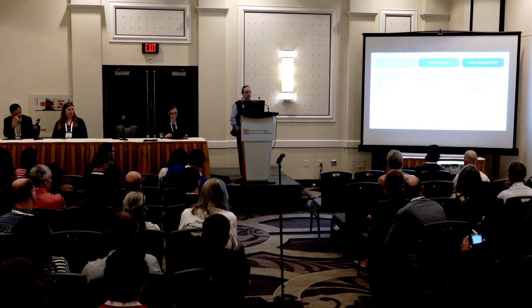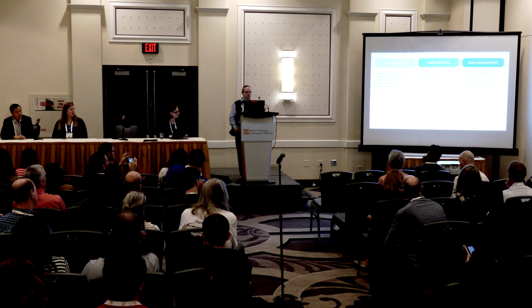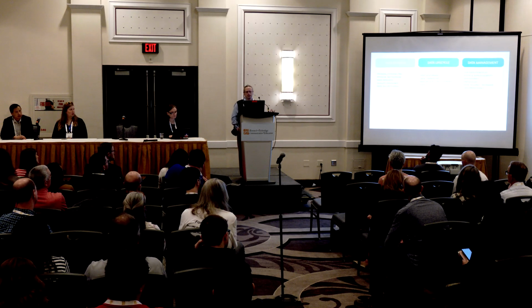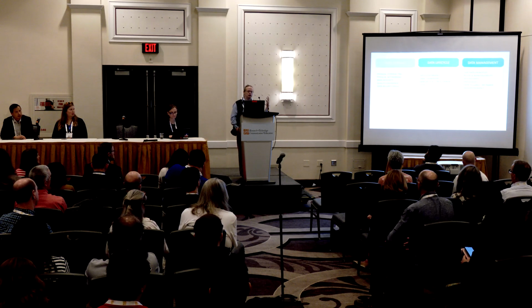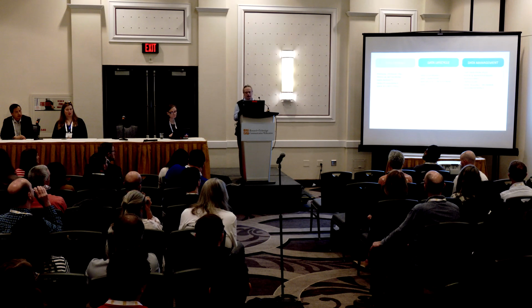And then lastly, questions about data management. And from our point of view, this is questions about really starting to get into questions like FAIR data principles, making data findable, accessible, interoperable, and reusable. Rigor and reproducibility, questions that ABRF has focused on for years. Repositories, ontologies, data tagging, metadata, and data provenance.